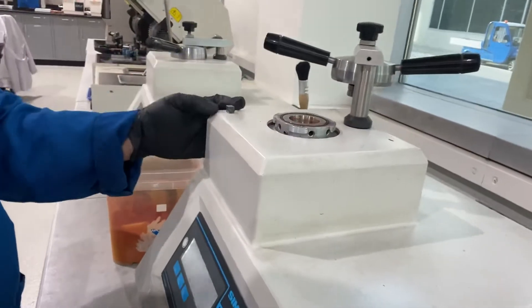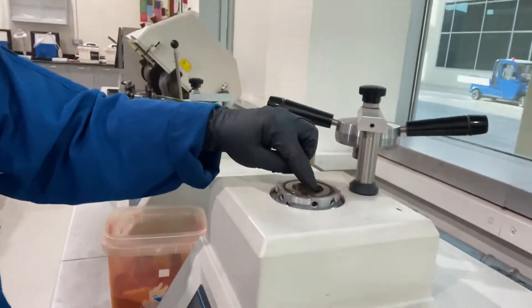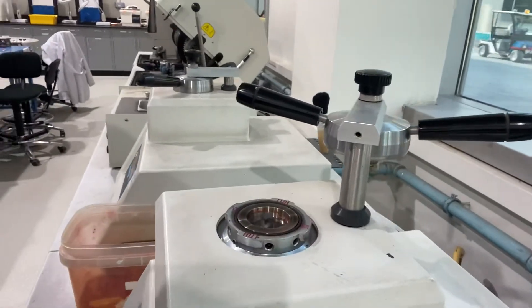Bring out your section specimen, load it in the mold facing down where the surface you wanted to be inspected, and lower down the piston ram.